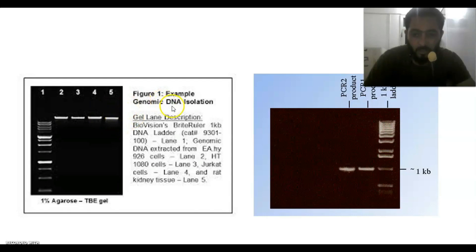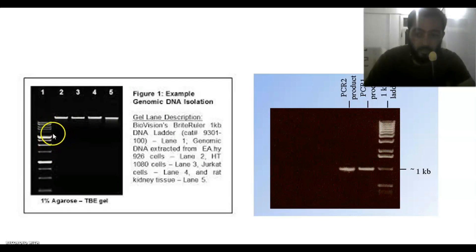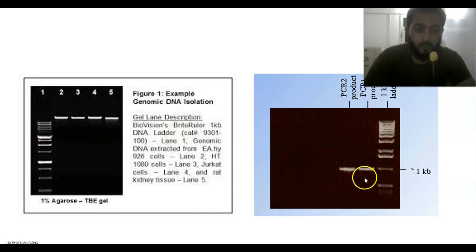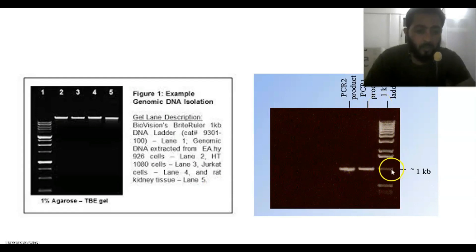This is a typical genomic DNA assessed by electrophoresis. Here we can see that the genomic DNA has low movement, so there is no need to use a ladder — it's not vital. This is a typical PCR product. You can see the difference in location: the genomic DNA is behind the ladder, while the PCR amplicon is within the range of the ladder.